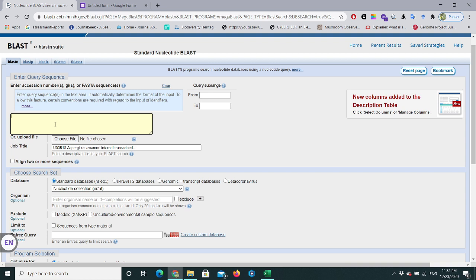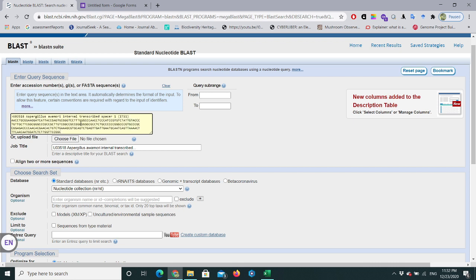In this section you need to upload or paste your sequences in different formats. You can use your accession number to search a particular sequence for BLAST analysis. You can also upload sequences in FASTA format — you can choose a file from your computer, or if you have a few sequences or just one sequence, you can directly paste it here. For example, I'm going to paste a single sequence in FASTA format.